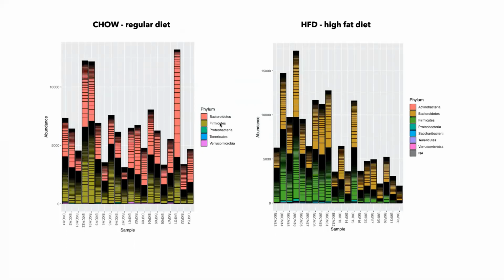And because they are different, I can analyze the richness, right? Richness means how many representatives from a diverse population are present in a given sample. And also, I can do so by group. And obviously, I can also count how many species, as well as how divergent they are from each other.